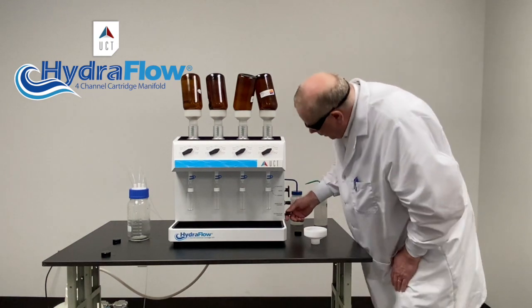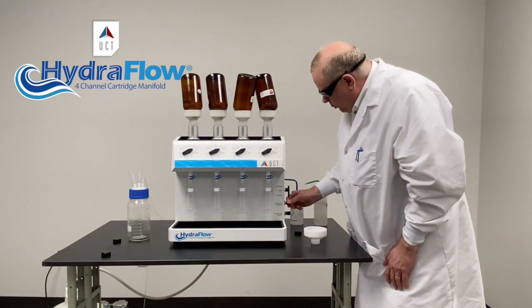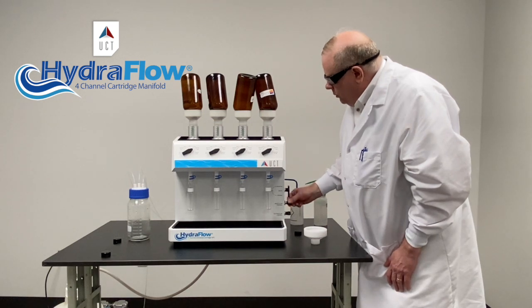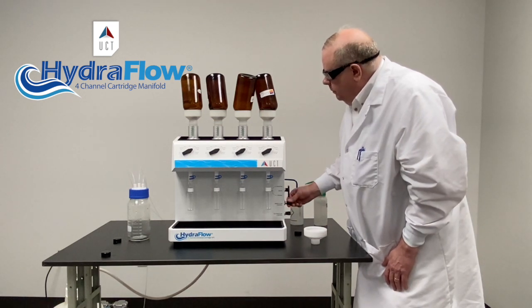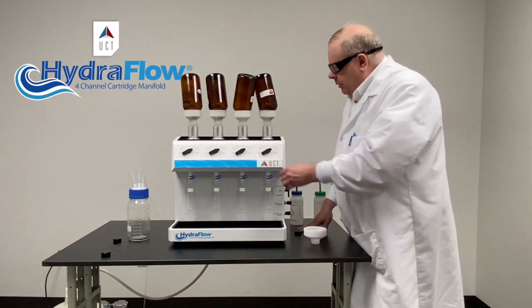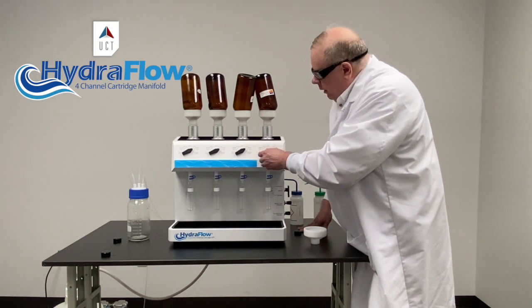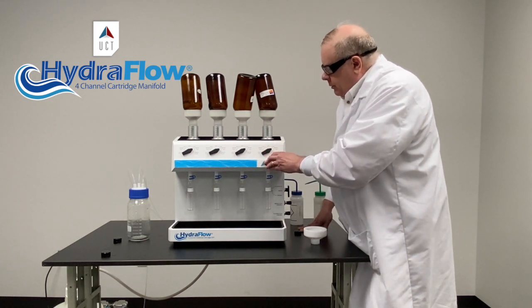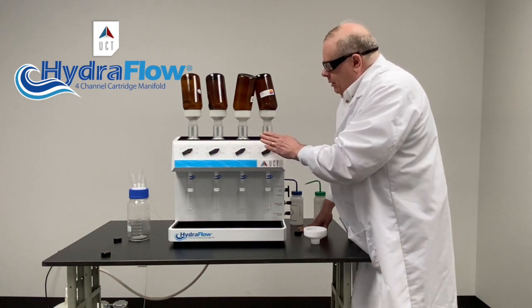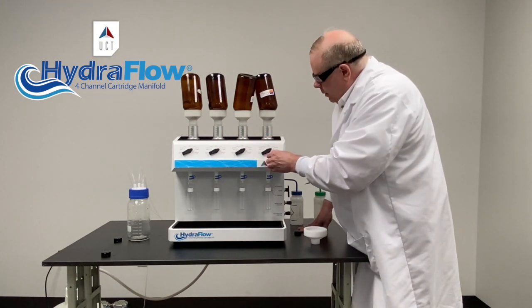You have fine adjustments over here. Here's our waste — we're sending the sample to waste. I can open up the vacuum or slow it down, whichever I need to do, by turning this knob. This is your fine adjustment, and this is basically your main adjustment here. A good thing about this, as I mentioned earlier, is if this sample is done and you're ready to elute, you can elute this station while another one is still loading — so you're not stuck doing one thing at a time.